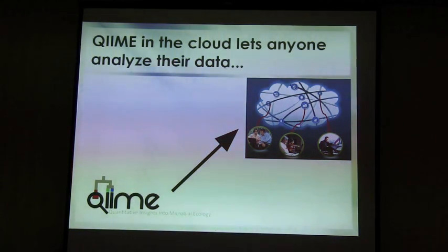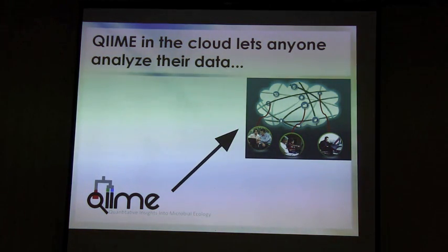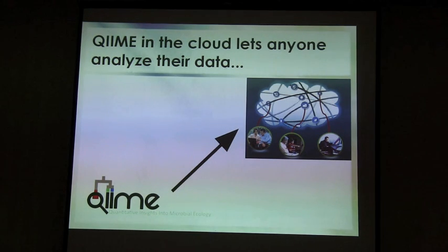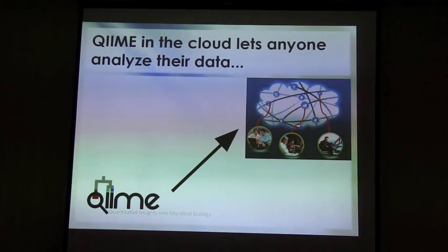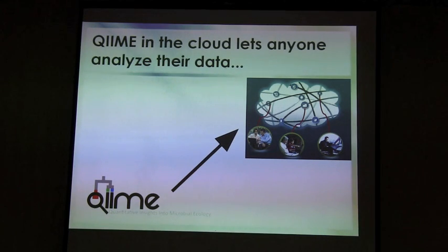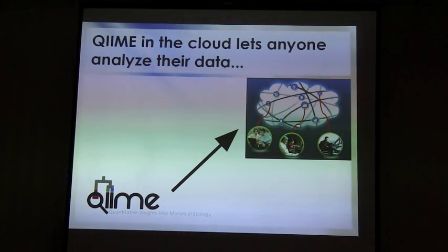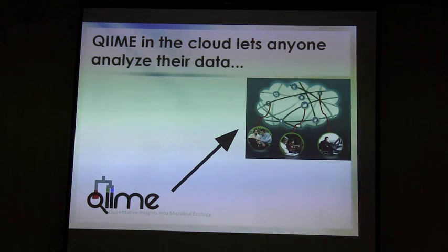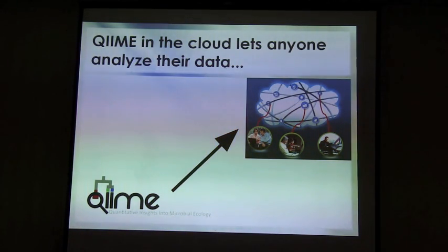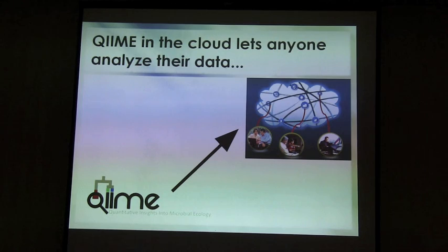For those of you who have your own data sets, we'll do a breakout session with some of the QIIME developers, so that you can sit down and try processing those, and we can troubleshoot any problems that come up. And in here, Greg will do the overall demo, looking at using IPython and Amazon EC2, and then we'll do a separate breakout session for those of you with your own data sets.